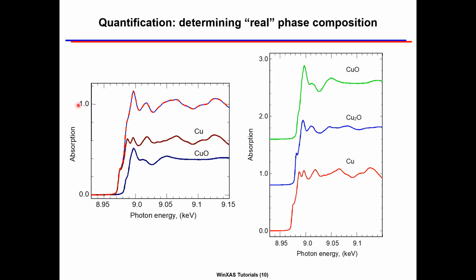Eventually, we are somewhat back to where all this started, with refining a sum of reference spectra to the experimental spectrum and determining its phase composition. However, after factor analysis, we can be much more confident in the results because we know the number and the chemical identity of the references to be used, which in turn confirms the integrity of our database.